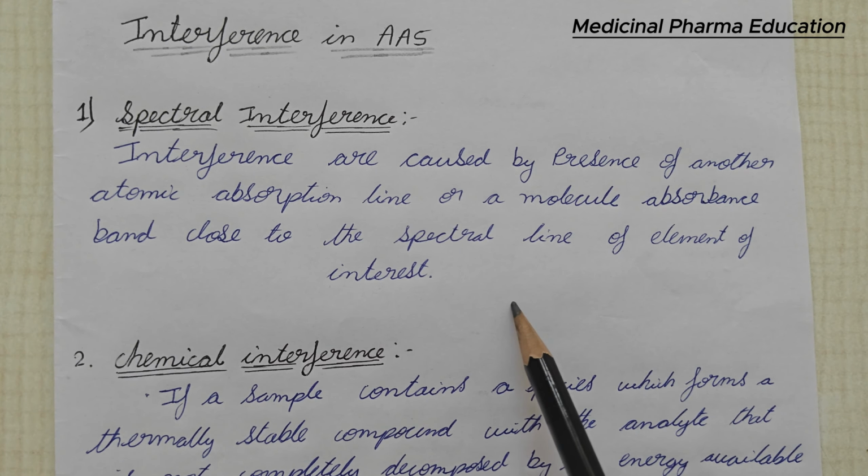If it forms a stable compound and that compound does not decompose, it does not absorb the energy available in the flame.